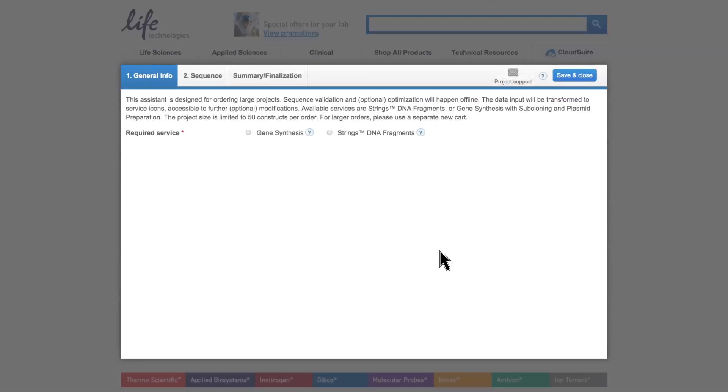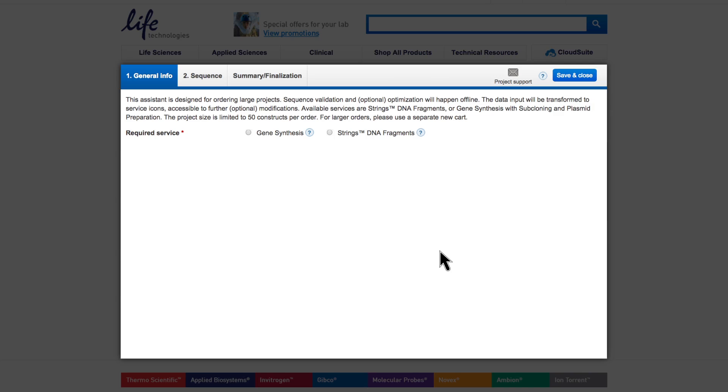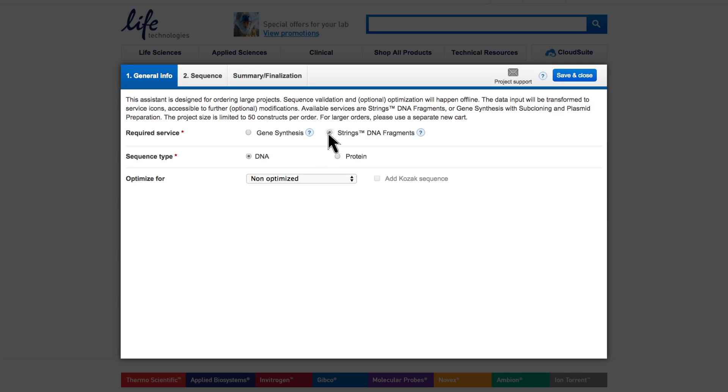How to order strings DNA fragments with the Large Order Assistant. Strings DNA fragments are ordered exactly the same as gene synthesis, with only one difference. Since strings DNA fragments are uncloned, double-stranded DNA fragments, no subcloning and plasmid prep services are available for this product.